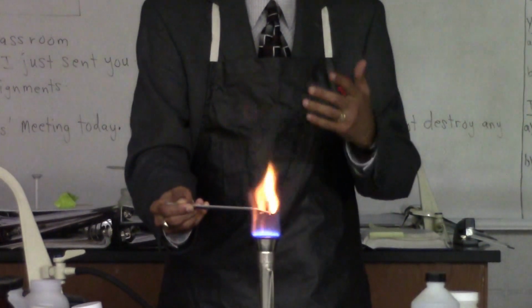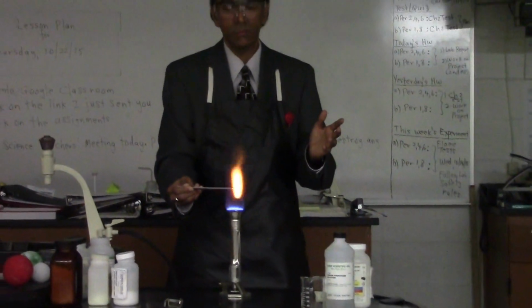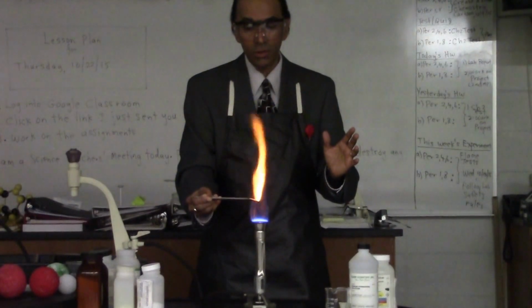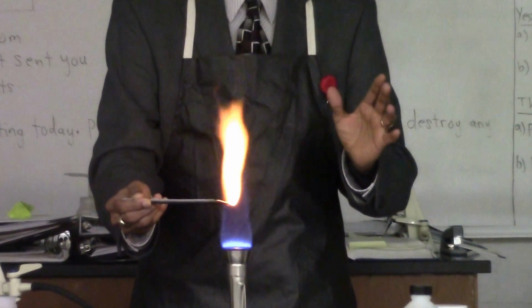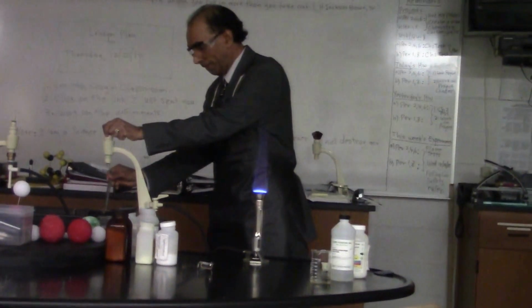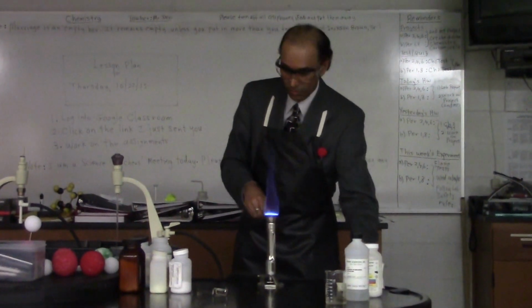And you can see that's a characteristic color for any substance that contains sodium. All right, so that's sodium chloride, and any sodium compound, including baking soda, baking powder, etc., will all give you the same color. All right, so that's the first one. Let's go to the second experiment.